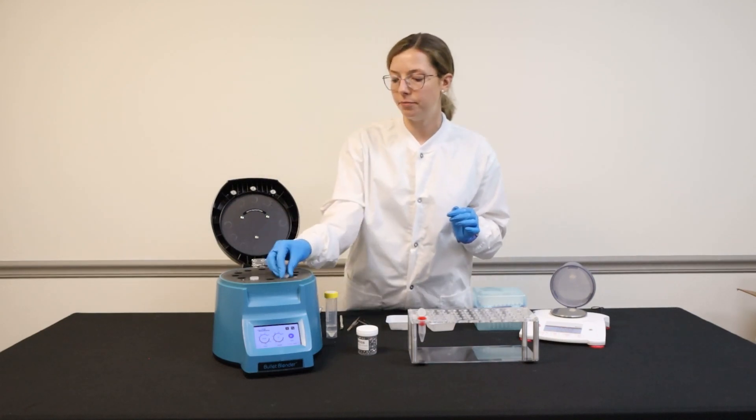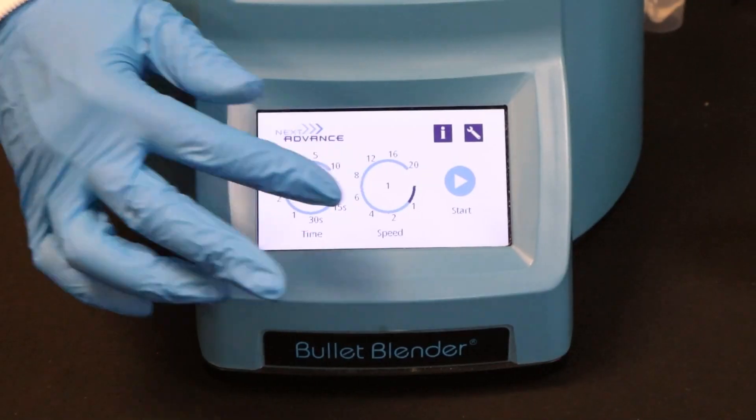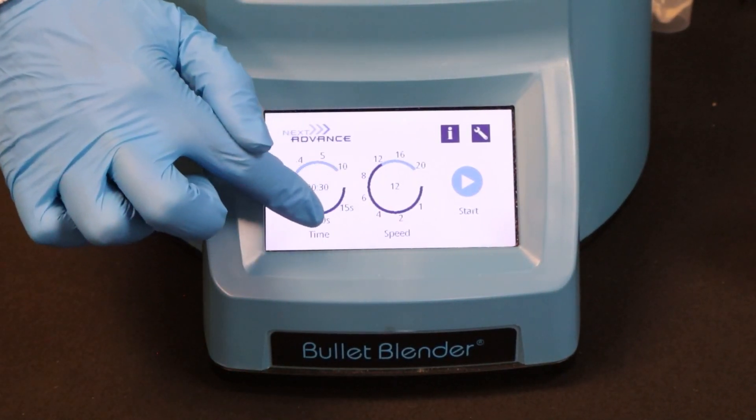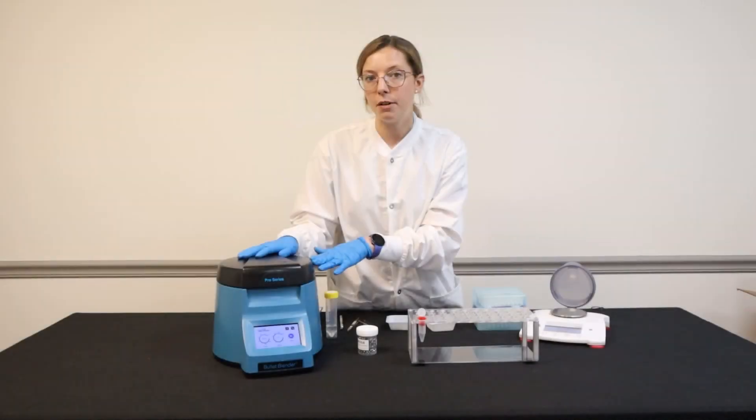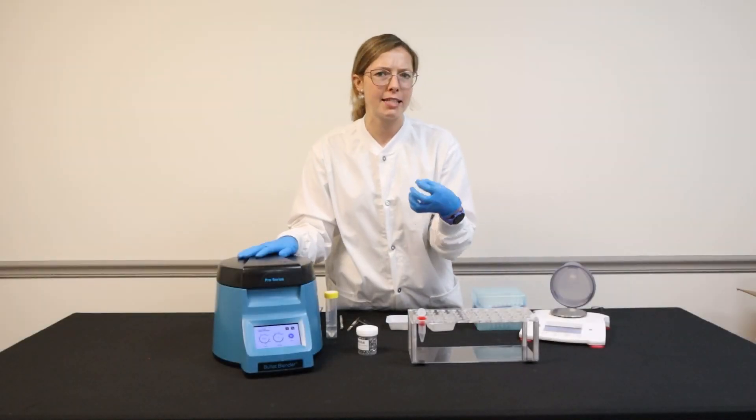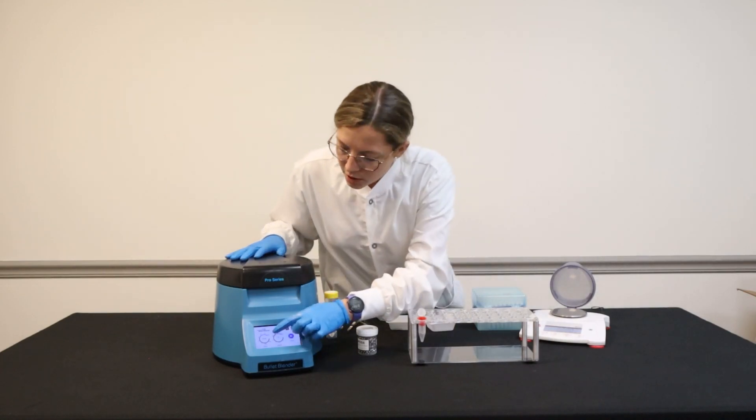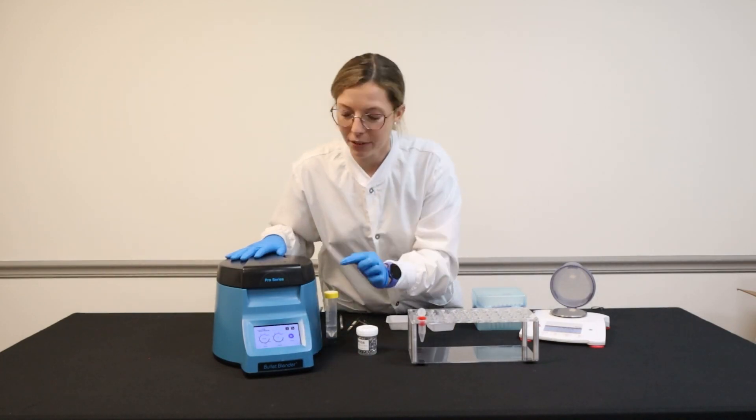For these samples, I'm going to homogenize at a speed of 12 for three minutes. The Bullet Blender does go up to a speed of 20, so if you have more aggressive, tougher tissues, feel free to adjust the speed as needed. So we're set for 12 and three minutes.